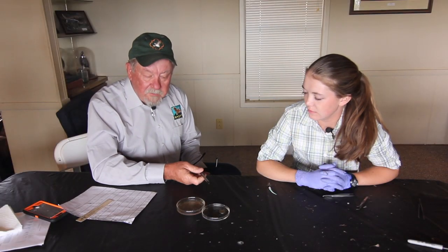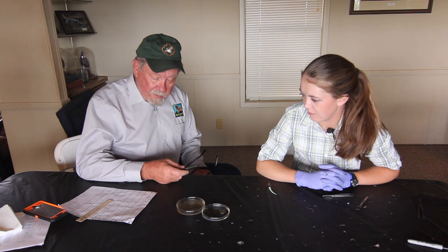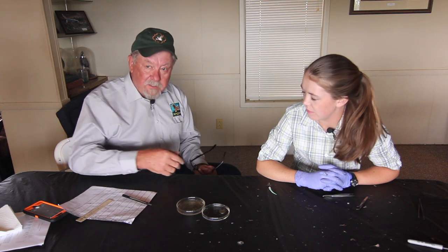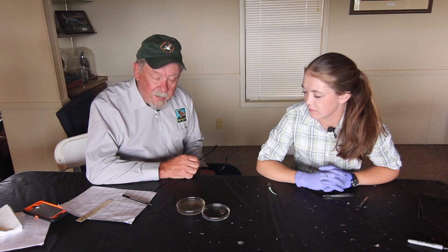You can see the relative size differences between the eye worms here and the cecal worms here, the cecal worms being about half the size of the eye worms. But again, the 300 and how many? 347. 347 here, and we're finding those kinds of numbers not uncommon in our quail, so we're quite concerned about that.